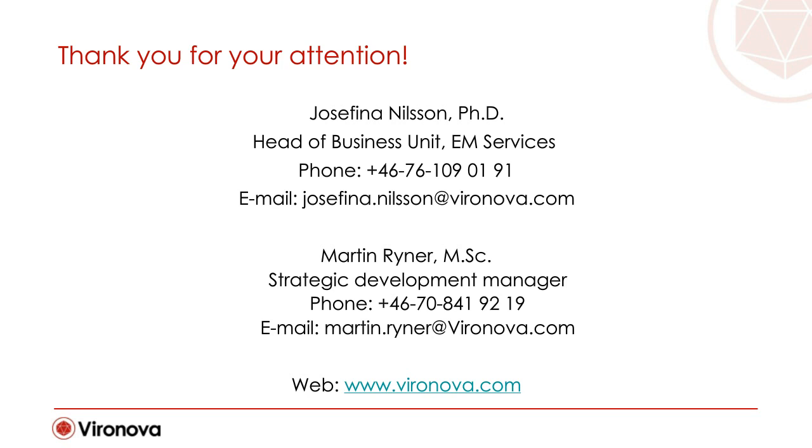Okay, thank you. Is TEM a method for characterization only or for release testing? I would say that this is up to the client. We have performed validation of some of the methods where we know that the client needs it because they use our data in clinical trials. And for batch release, I'm not sure if any of our clients are using our data.